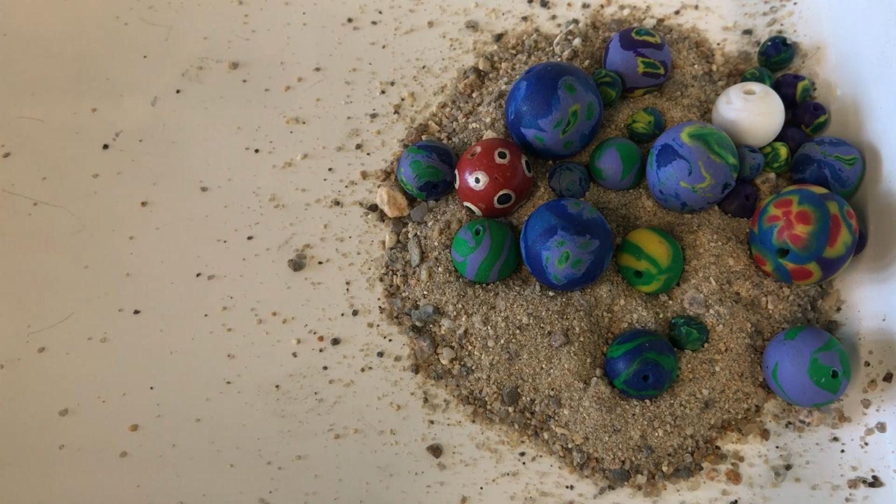Okay, so the principle of making a blood smear is you take a drop of blood, which is a mix of a bunch of different kinds of things, different kinds of cells, erythrocytes, leukocytes, thrombocytes, and then the fluid part of the blood, basically water with some small stuff mixed in. So blood is a mixture of a bunch of different sized things, and when we make a blood smear, we put a drop of blood on a glass slide, and then we smear the blood across that slide to spread things out.